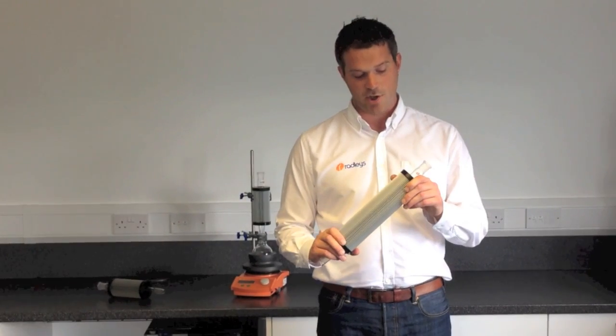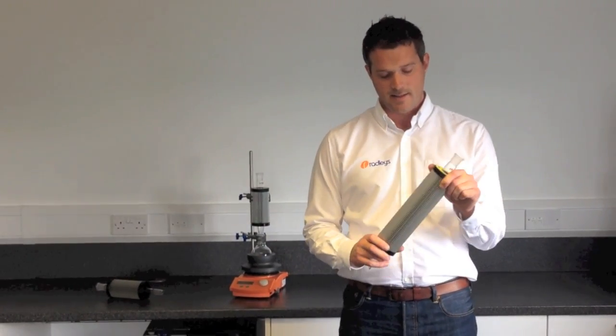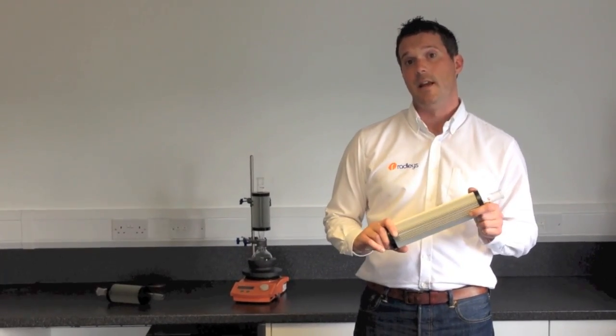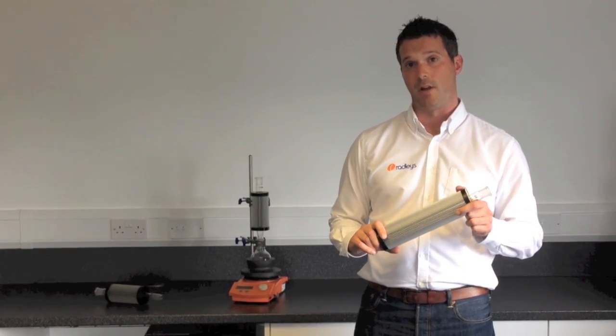Hi, I'm Ben from Radley's. I'd like to show you the Radley's Thindenser. This is a super air condenser that replaces the need for water condensers in over 95% of all chemistry applications.